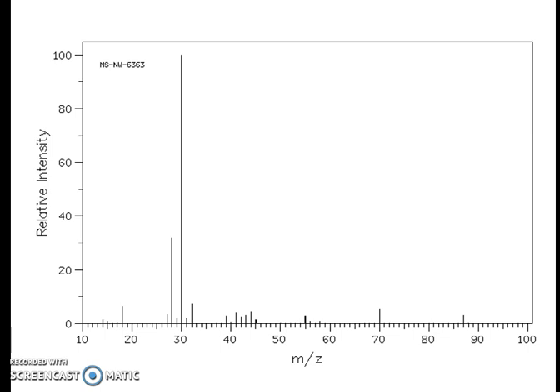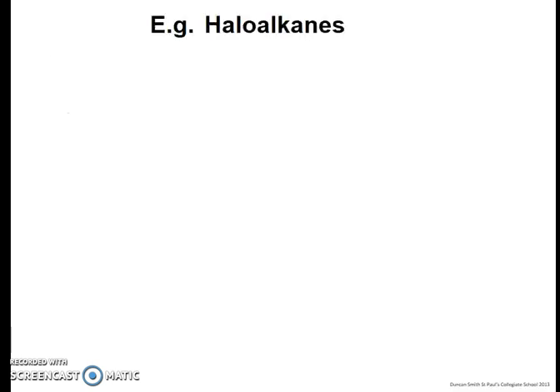Okay, here's another one. Down here you can see the molecular ion peak at a mass to charge ratio of 87, which again indicates the presence of an amine or an amide. In this case, I would think that it was an amine based on some fragmentation patterns and things.